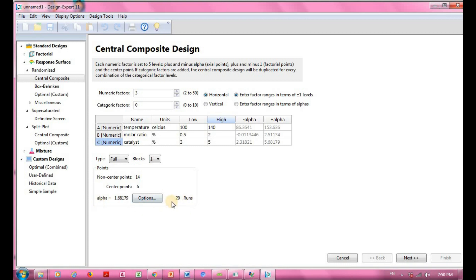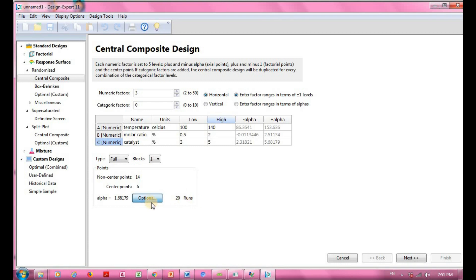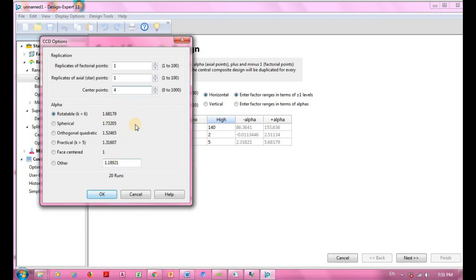To change the alpha value, click on Options. Here replication can be divided into three types: factorial point, star point, and center point. I'll leave factorial and star point as one, but I'm going to change center points to four. Based on literature I reviewed, the recommended number of center points lies between two and four. This gives me a total of 18 experiments.